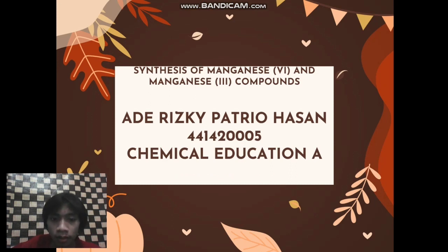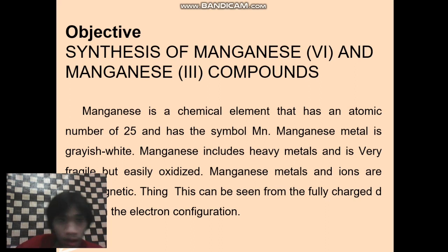My name is Rizky Patrio Hasan, NIM 441420005, from Chemical Education Class A. Here I will present a practicum in the synthesis of manganese 6 and manganese 3 compounds. The objective is the synthesis of manganese 6 and manganese 3 compounds.